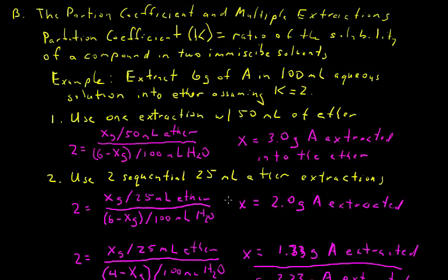But using the same total amount of solvent, we're now going to add another portion. It's very important you realize what's happening here. We've extracted once with 25 milliliters of ether. That's in our separatory funnel. We remove the bottom layer and then isolate the 25 milliliters of ether into a separate flask. Then we're going to pour. Remember, the ether was on top.